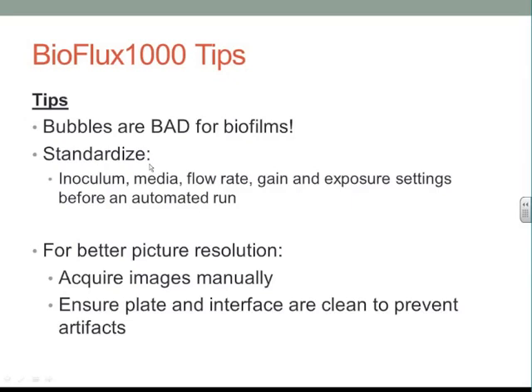It's hard to really grasp if you're getting the full potential of the biofilm growth. For better picture resolution, I've included these little snippets down here to acquire images manually. If you really want to get a great picture, I know the videos are awesome, and they really show that, but if you want a picture for publication purposes, sometimes it's really nice to just take the pictures as a snapshot, and then you can use the videos to supplement that data.